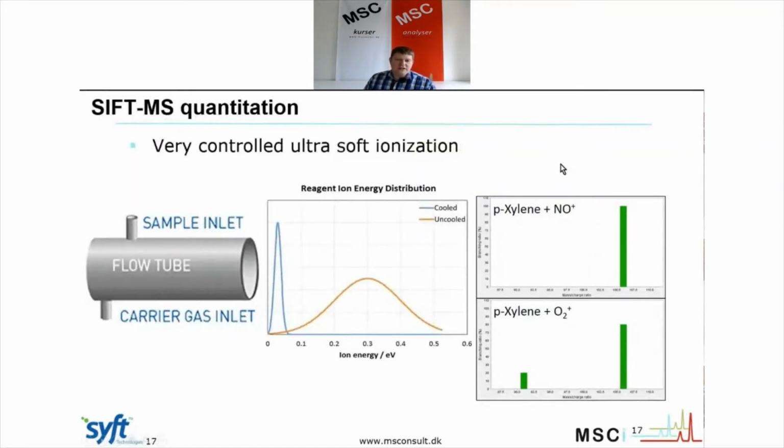And as I mentioned, we want as few peaks as possible, because we want as clean mass spectra as possible, since we don't have the chromatography for separation. So if we ionize with electron ionization that uses 70 electron volts, we would get a lot of fragmentation. If we have, let's say, 5 compounds at approximately 100 mass over charge and we fragment them a lot, then it will be really hard to see what comes from which compound. That's why we want lower ionization energy.